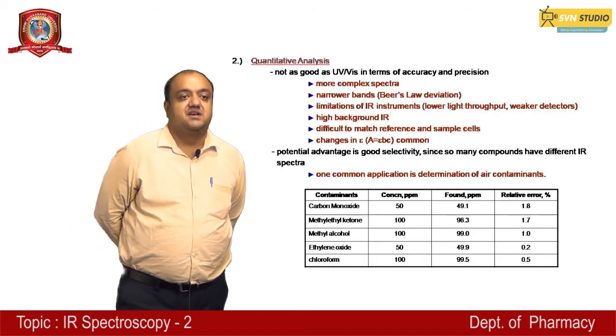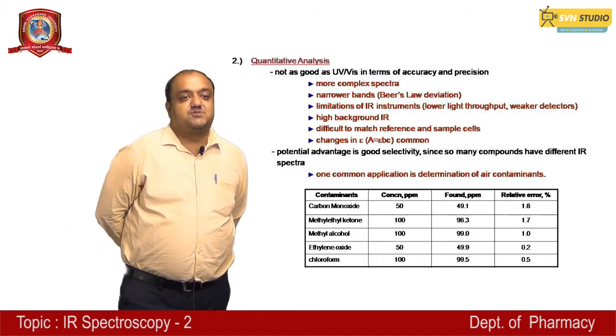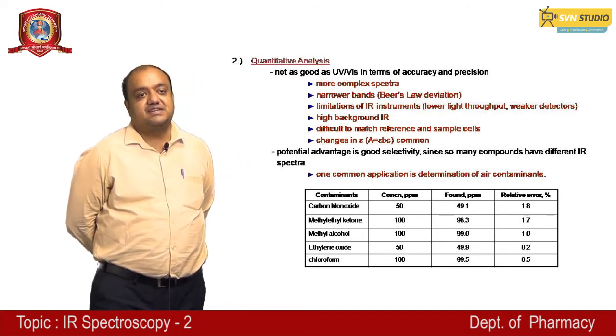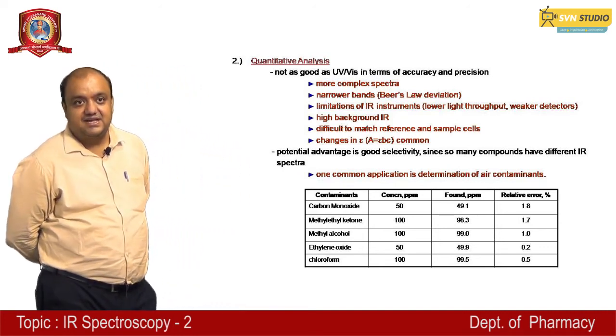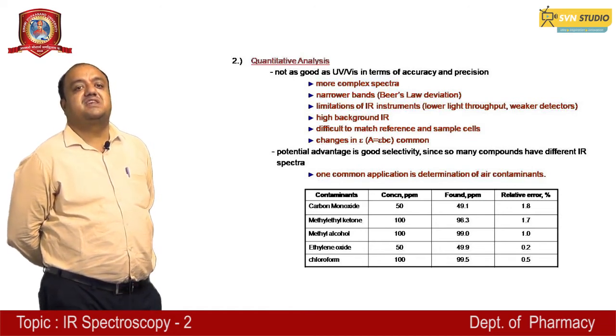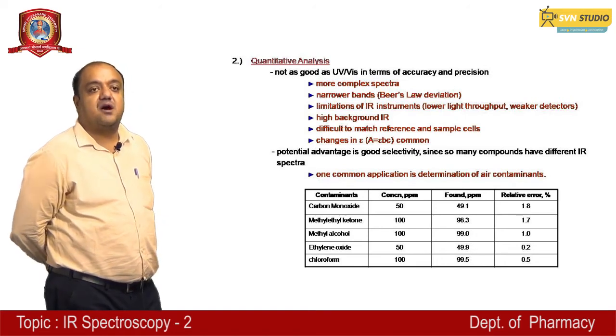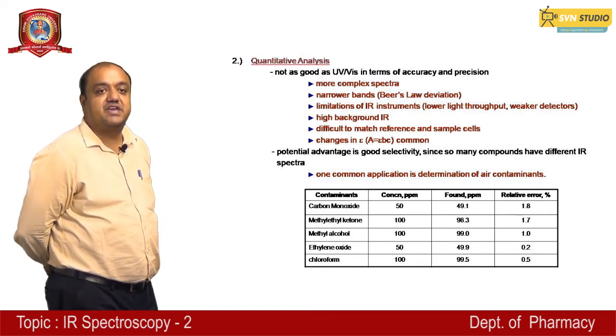Change in absorptions is common, and a potential advantage is good selectivity, since so many compounds have different IR spectra. One common application is determination of air contaminants.